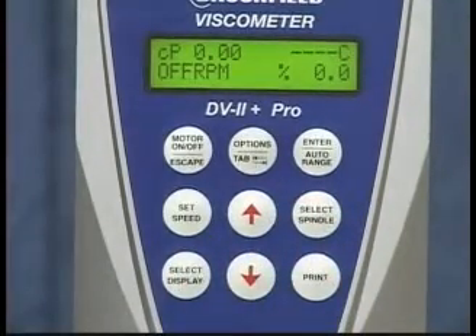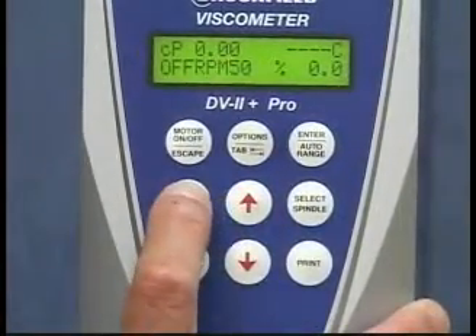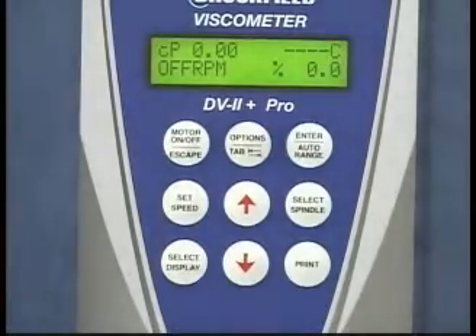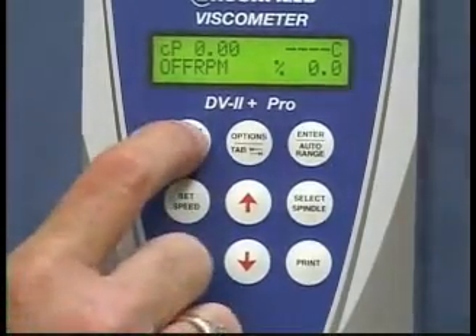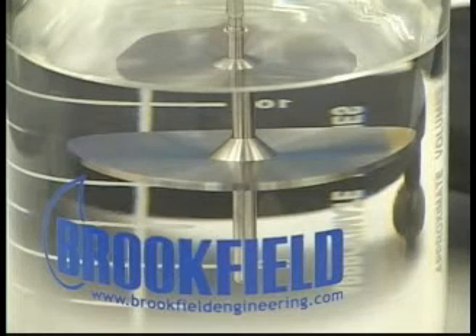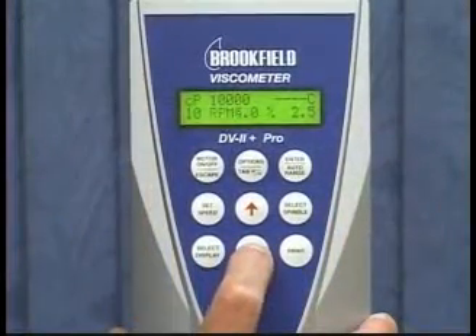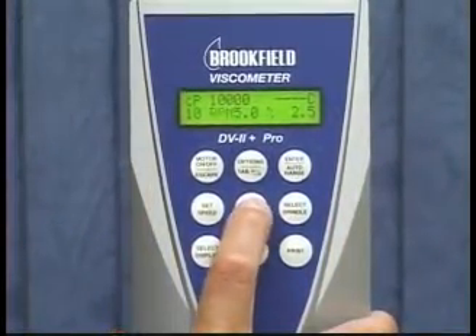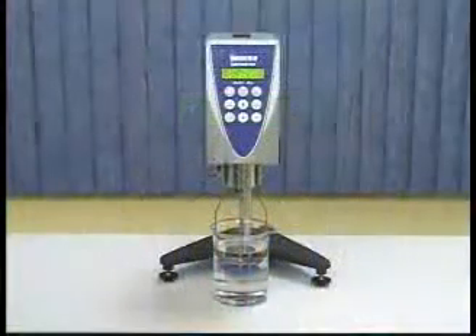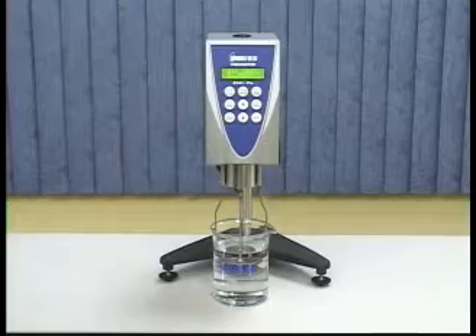To set the speed, scroll using the up-down arrows to the speed of choice and press the set speed button. Press the motor on button to rotate the spindle. If you need to take readings at multiple speeds, repeat the same process. It is not necessary to turn the motor off to change speeds. That's it. You've taken your first reading and should now be able to take many more on your own.